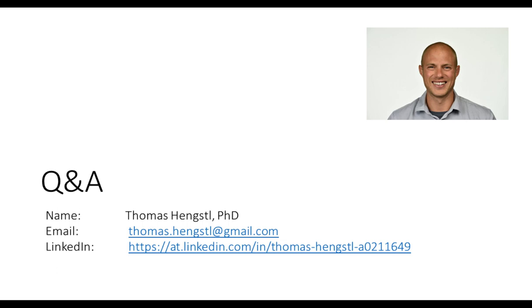If you can sequence 5 million sequences, and you have 5 different libraries, you would get 1 million. If you have 50 libraries, you only get 100,000. But in general, as a rule of thumb, somewhere between 10 and 50,000 should be enough if you see enrichment.